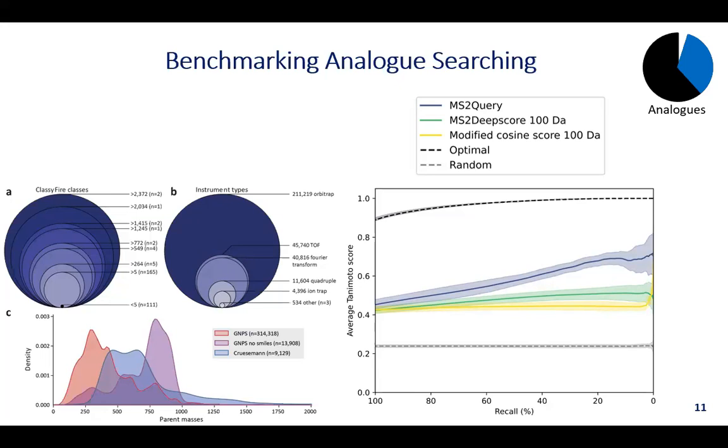So we need to take into account that there is bias in the library, and if we compare the contents of the library with a bacterial extract, we can see that the mass distribution alone is already completely different. So in other words, these models are also biased, and you will have to validate the results. That's basically what I'm trying to say.